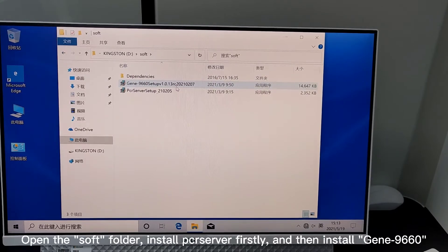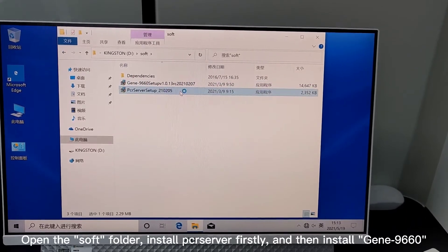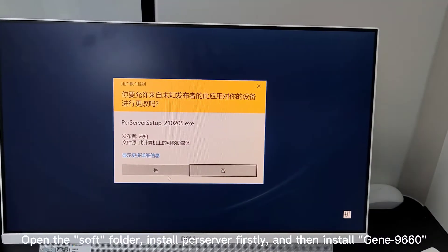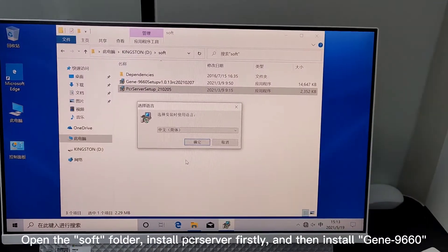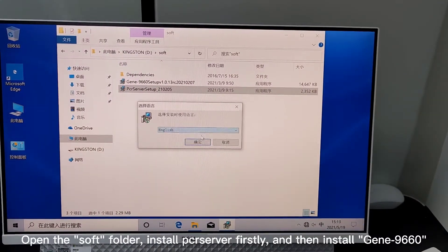Open soft folder. Install PCR server firstly and then install Gene-9660.